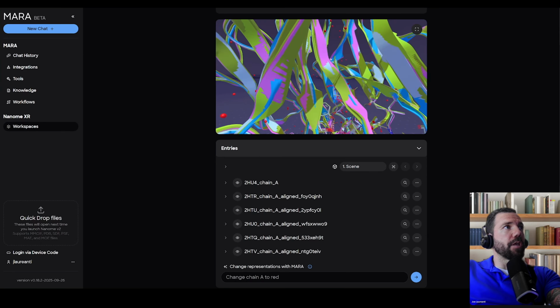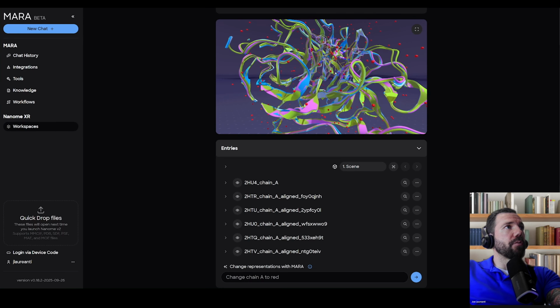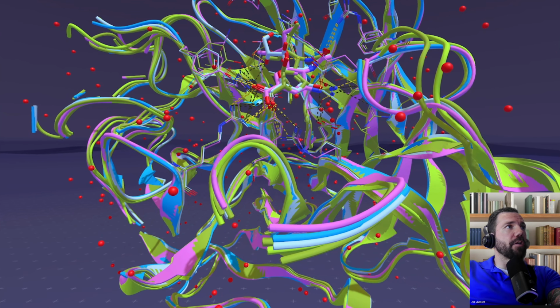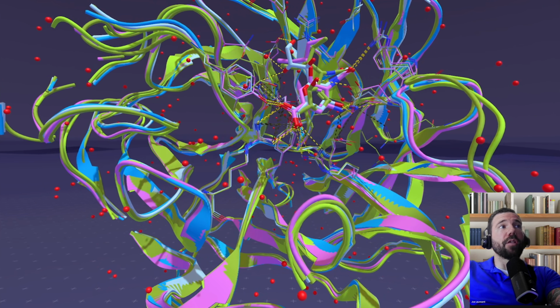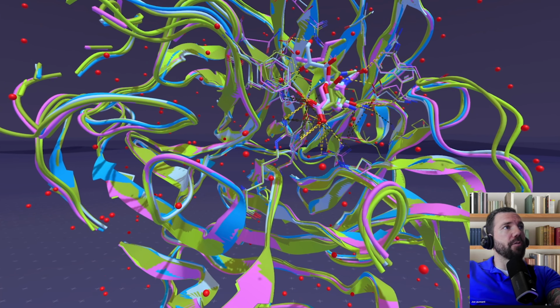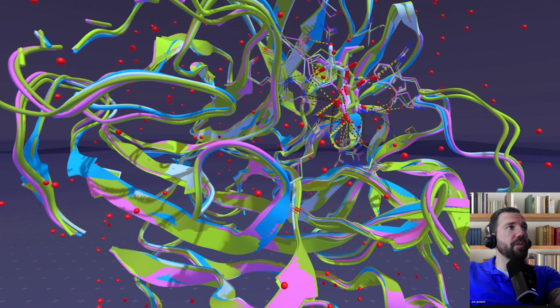All right, everything is aligned. We've got our ligands in here as well. You can see our hydrogen bonds. And we also have full screen. So nice, beautiful structures. We can see that 150 loop over here that I was talking about that is mobile and stationary. So it has 2 forms, open and closed. So we'll look at that in VR when we get there as well. But yeah, so cool. A available preview into Nanome V2 on the web.